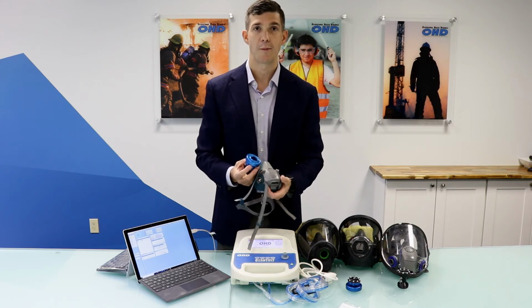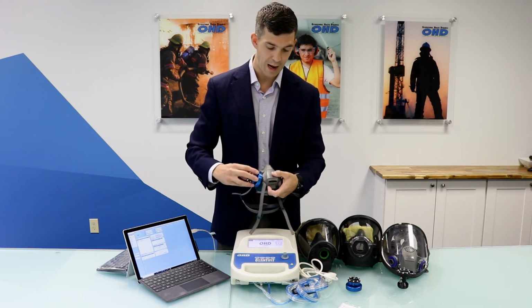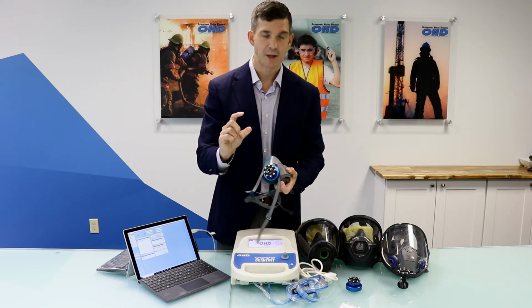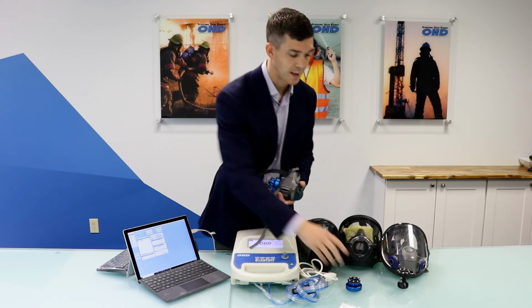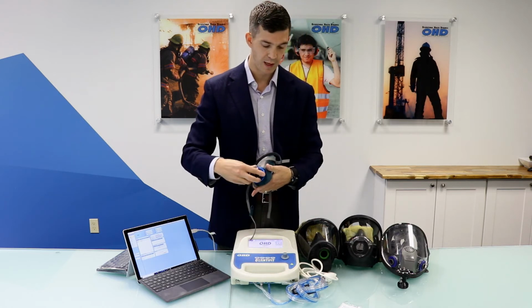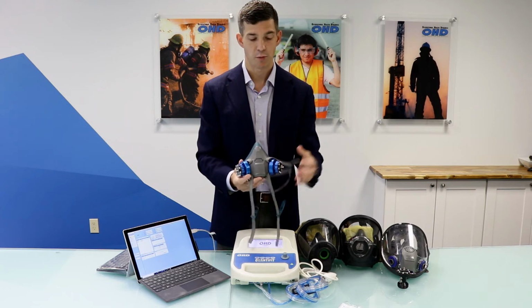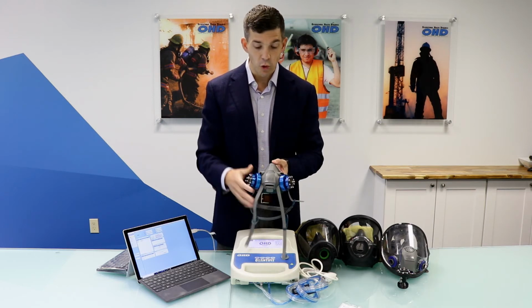I'll show you a single adapter in just a second. The dual-sided adapter will connect up just like a filter would. So you get the connection pieces up, you connect that side in, and then you connect your single port side. So for fit testing a half mask elastomeric respirator, you'll have a dual adapter.